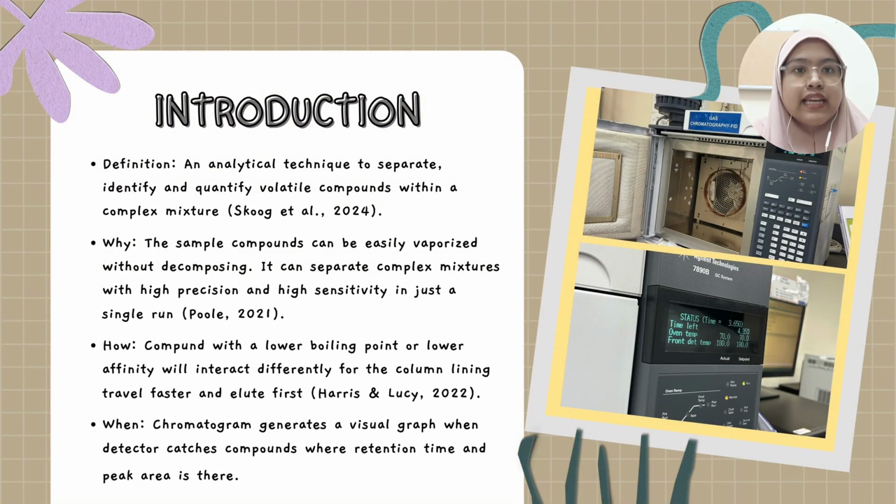So what is gas chromatography? It is a powerful analytical separation technique used to isolate, identify and quantify volatile chemical components within a complex mixture. The fundamental theory relies on the differential partitioning of analytical molecules between a vaporized mobile phase, typically an inert carrier gas like helium or nitrogen, and a stationary phase contained within a heated column.